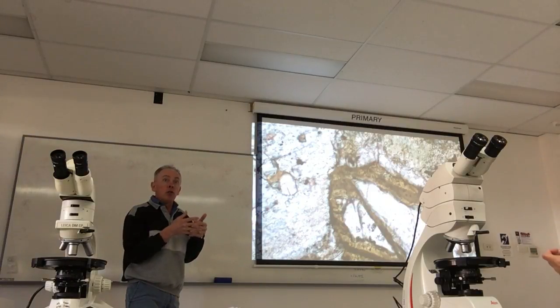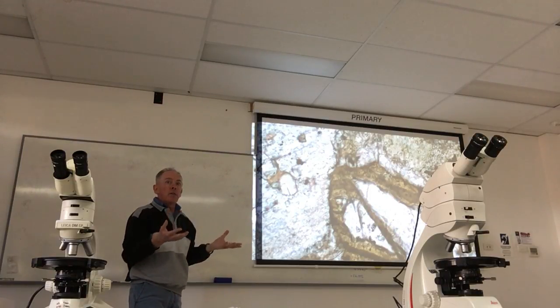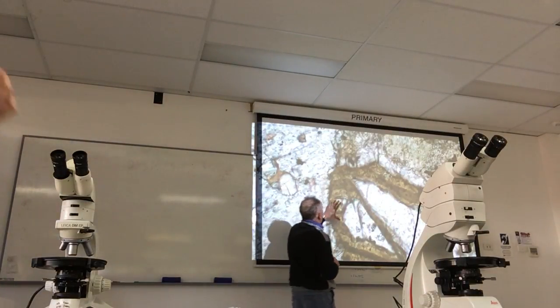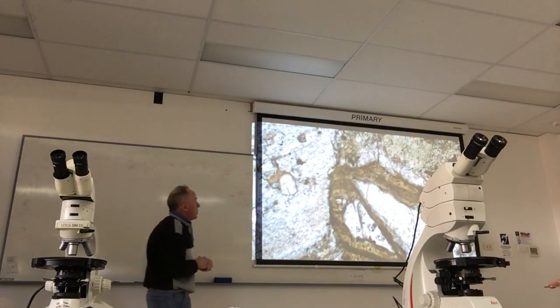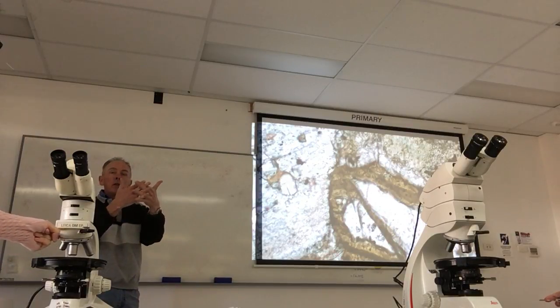The overgrowths happen during the magmatic stage. It's happened during the crystallization interval. This stuff here has happened below the solidus, and it's just hydrous, aqueous fluids altering the stuff, basically. So don't fall into the trap of mistaking those two. When you look at it, I'm suggesting here that you need to go into high power and have a closer look. Once you do that with this slide, you can see straight away that it's just a mass of interlocking crystals.